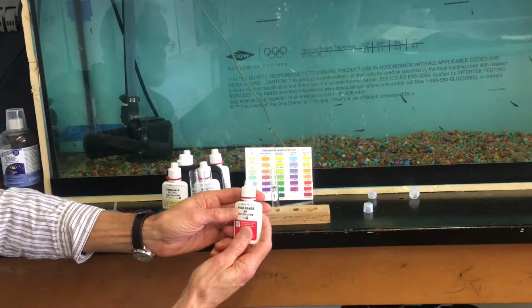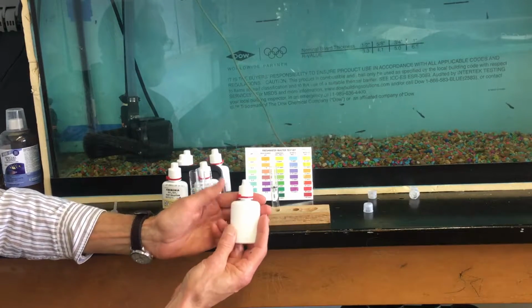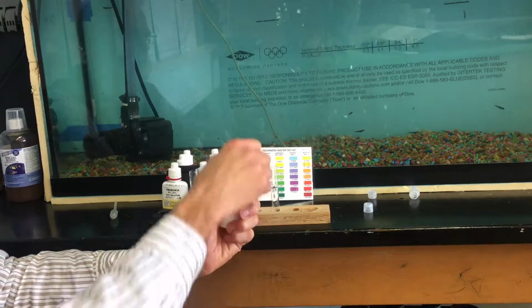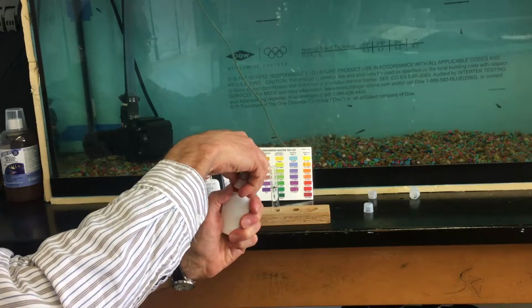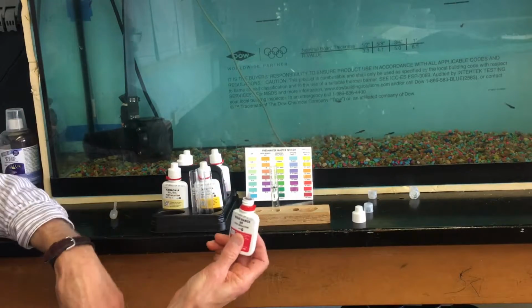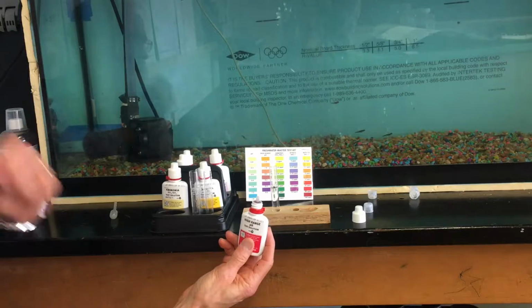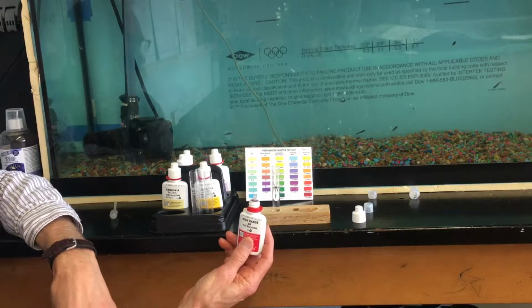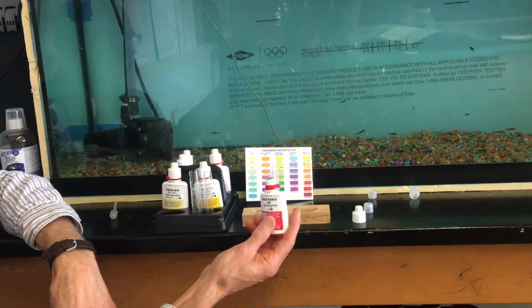This is the high range pH test solution. I open the bottle by holding that red tab with my thumb, hold it tight, and turn and open it. If you don't hold that red tab, it will lock the cap and you can't open it. I take the bottle and I turn it directly upside down on top of the test tube, set it right down hard on the test tube, and count my drops.